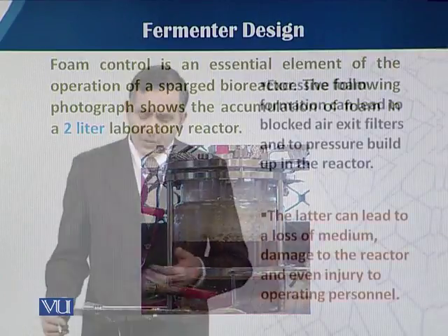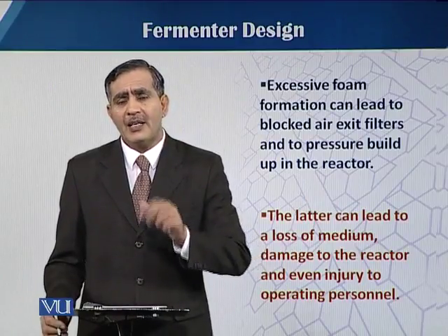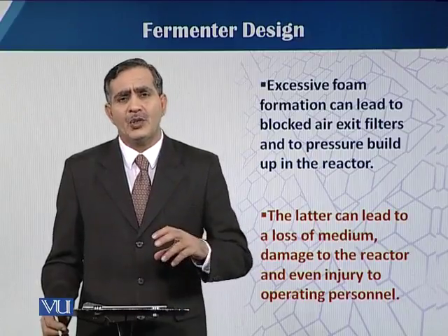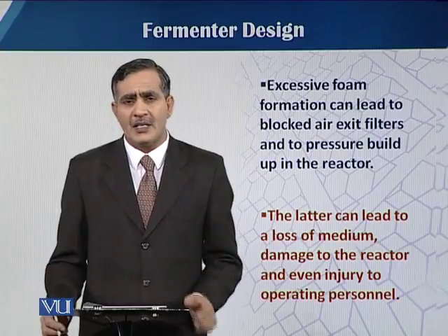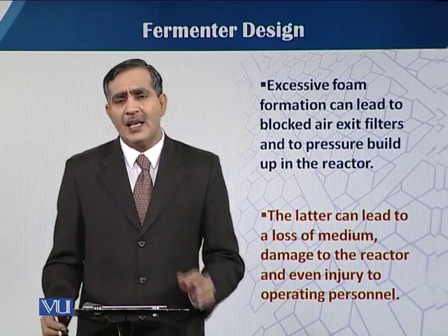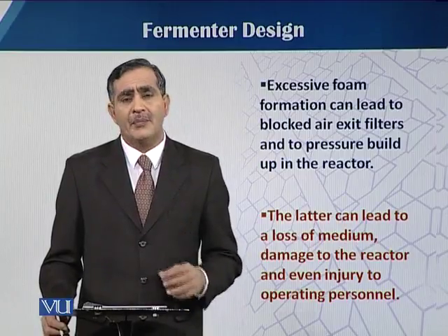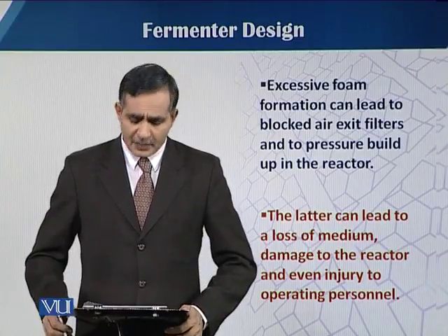So excessive foam formation, when it tends to go out from the exit point, can choke the air sterilization system, which we call the filter. In such a case, there is a disturbance that can cause pressure inside the vessel. So there are many things that can happen.